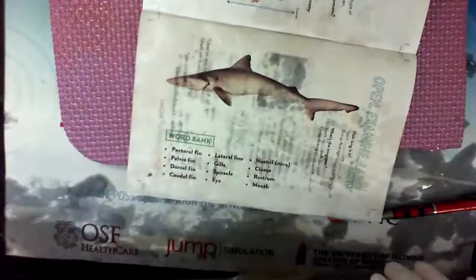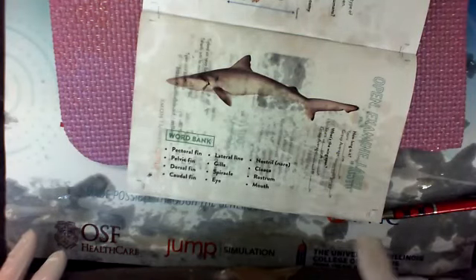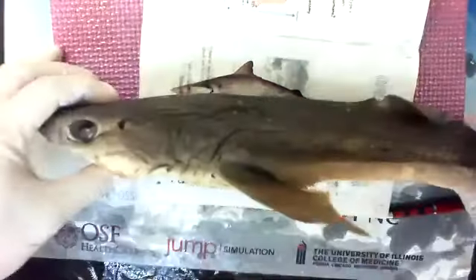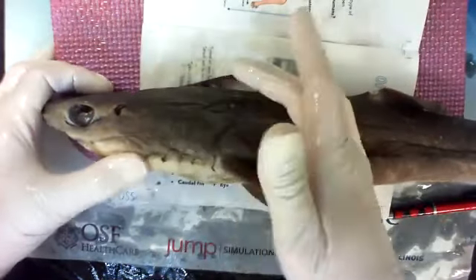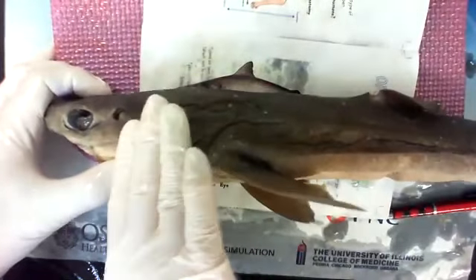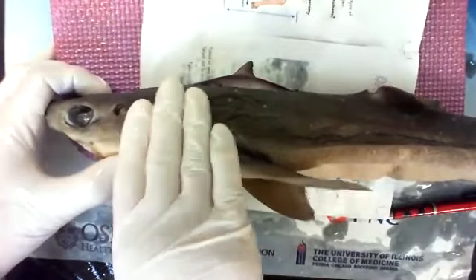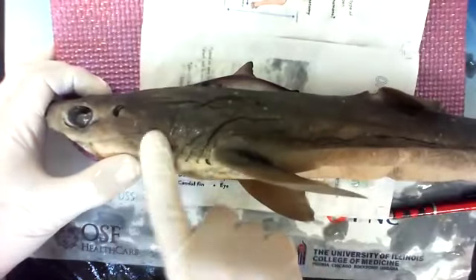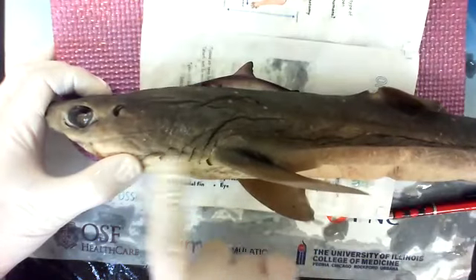The lateral line is actually a sensory organ. So it has a special sensation you don't have, and we'll talk about that later. And that lateral line has all the little structures in it. Gills, here. Bony fish, like a bluegill or a goldfish, actually have a bony structure that covers it. It's a gill cover. And when they're trying to breathe, you'll see them moving that gill cover because they're pushing water over their gills all the time so that they can breathe.